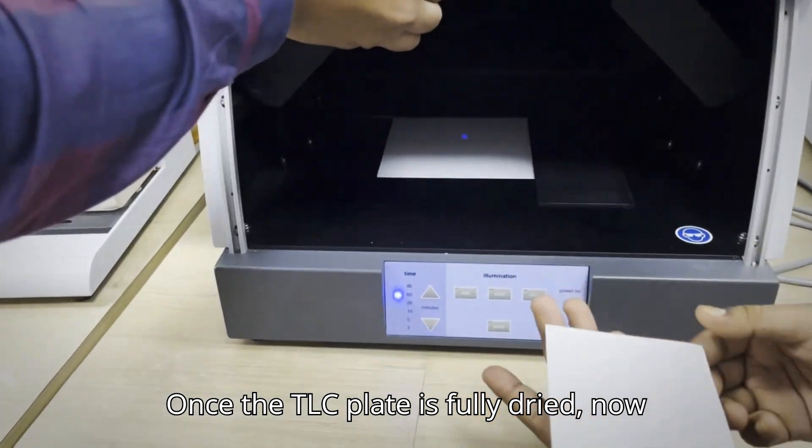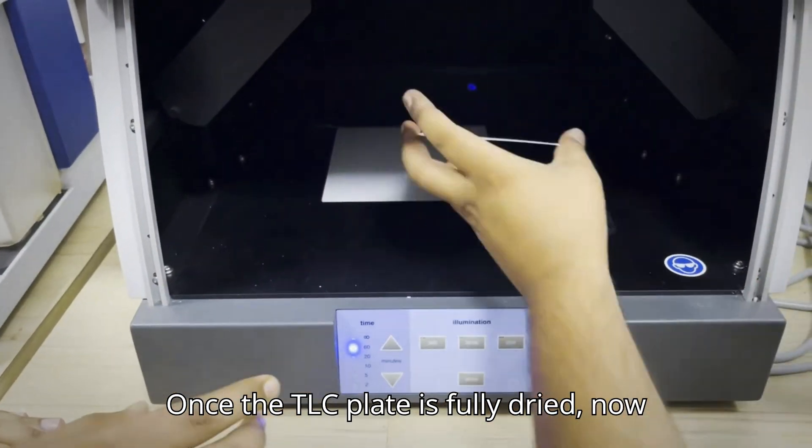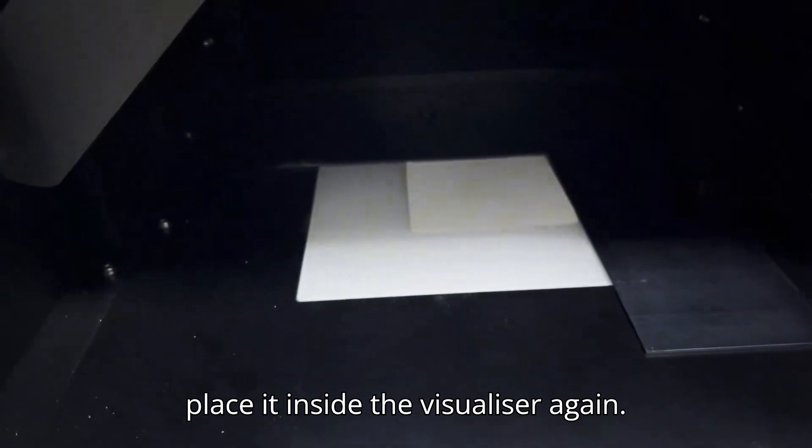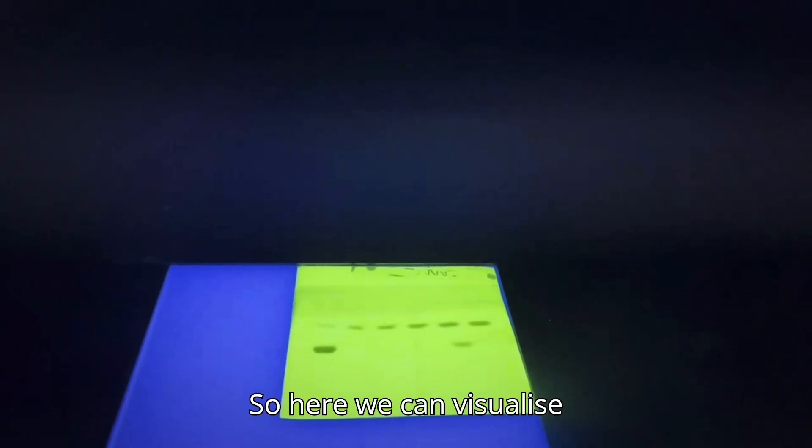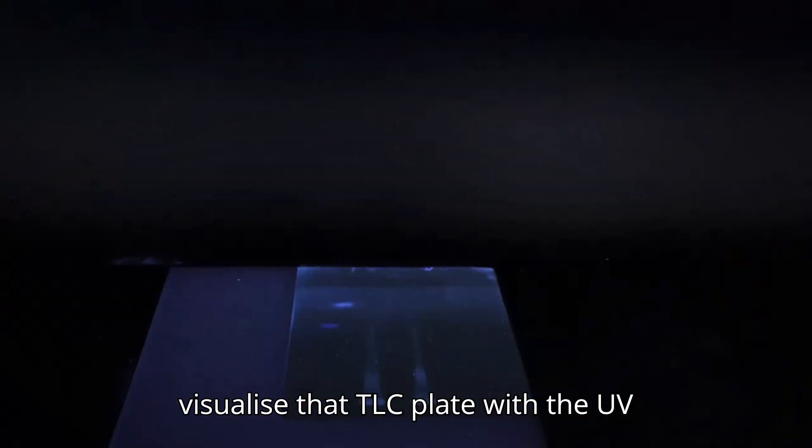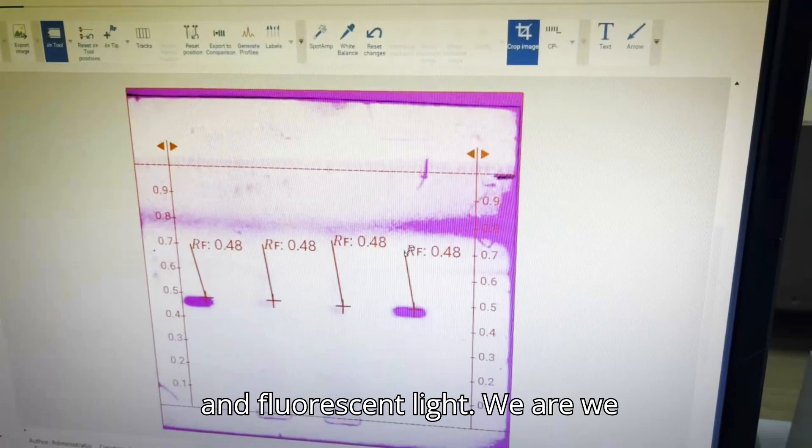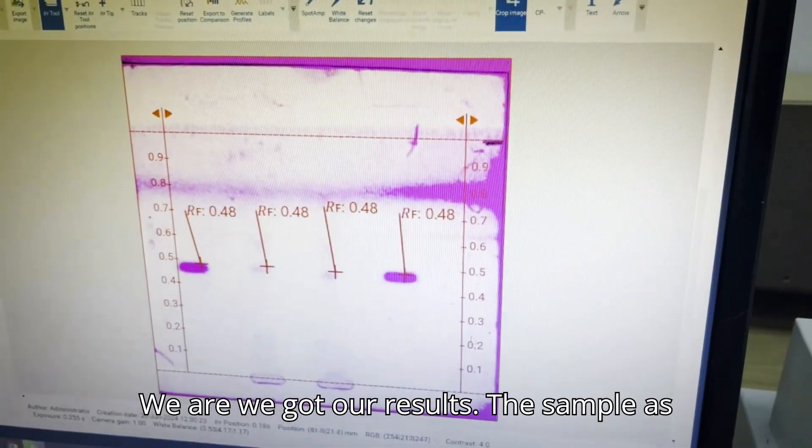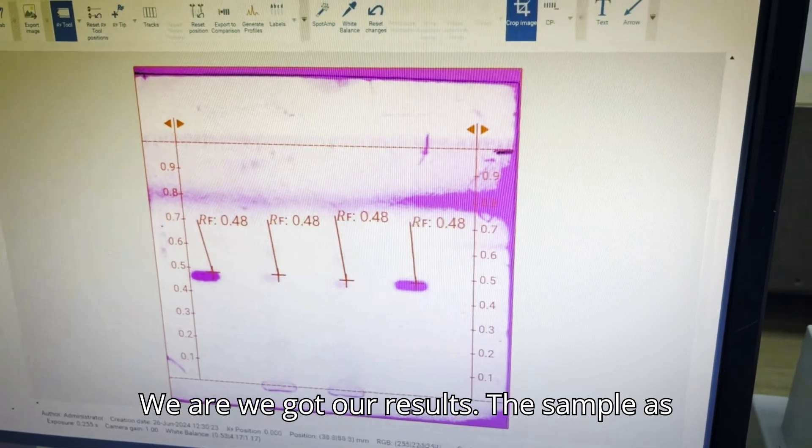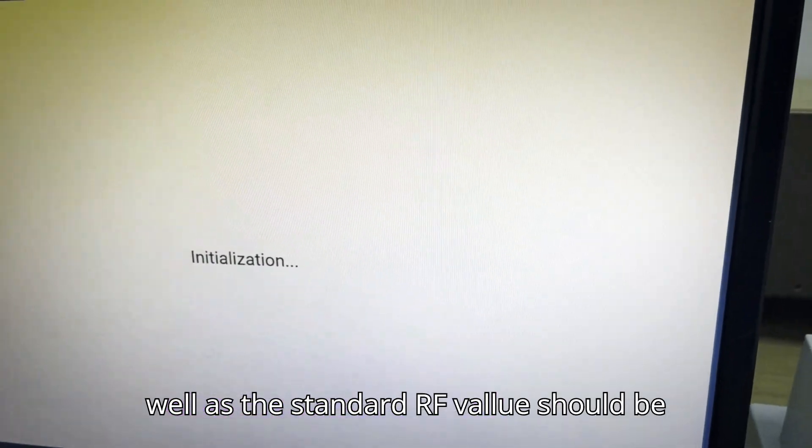Once the TLC plate is fully dried, now we will place it inside the visualizer again. Here we can visualize the TLC plate with UV, visual and fluorescent detector. Here we got our results. The sample as well as the standard RF value should be equal.